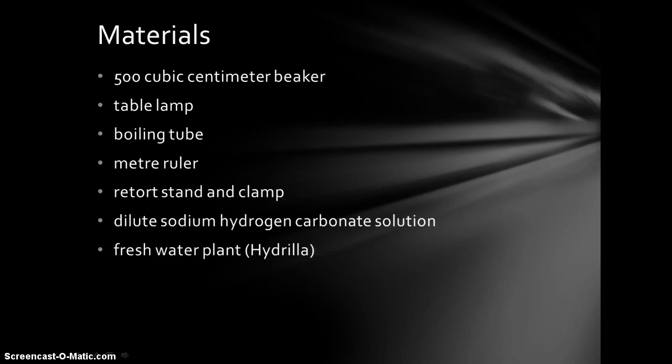The materials will be a 500 cubic centimeter beaker, a table lamp, a boiling tube, a meter ruler, a retort stand and clamp, a dilute sodium hydrogen carbonate solution, and a freshwater plant. In this case, we are using a hydrilla.